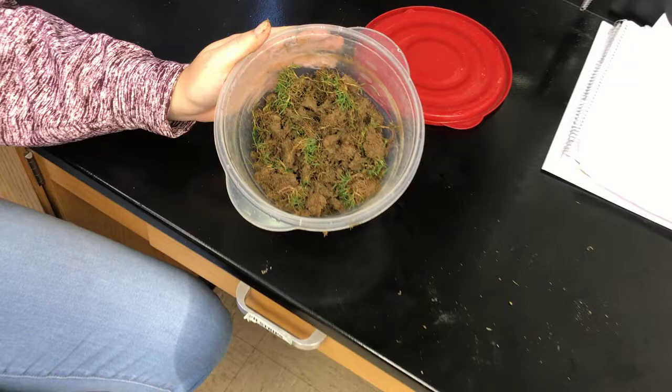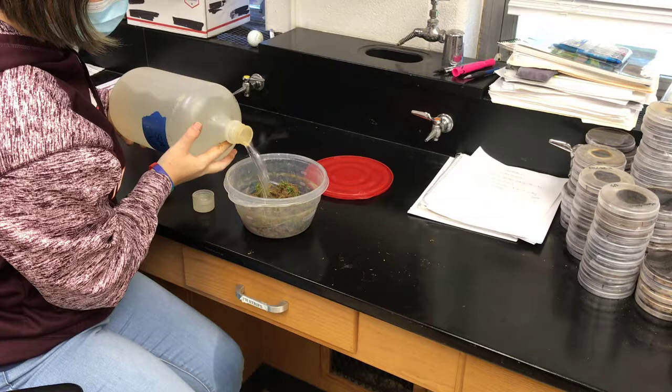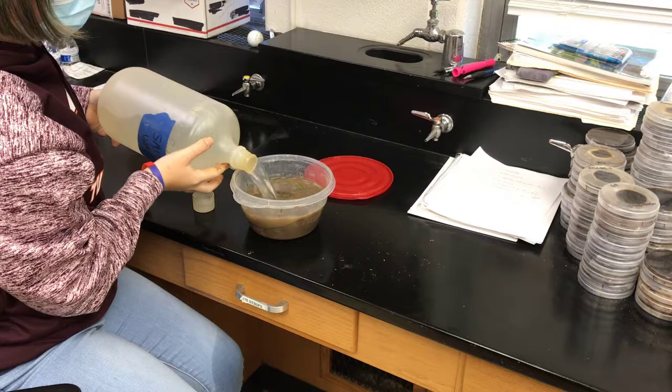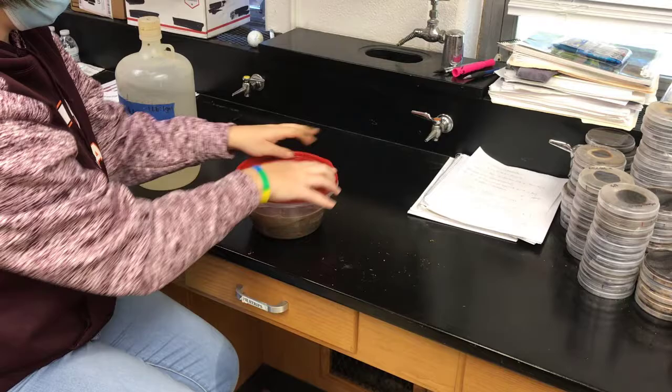Repeat this one-minute process for each of your three plugs. By the end, you should have something that looks a little like this. Now take a saltwater mixture — which is one pound of salt to one gallon of water — and pour it into your container. Be sure to cover the plugs fully and leave about an inch and a half of air space at the top of your container. Once you've finished pouring your mixture, seal your container as tightly as possible.